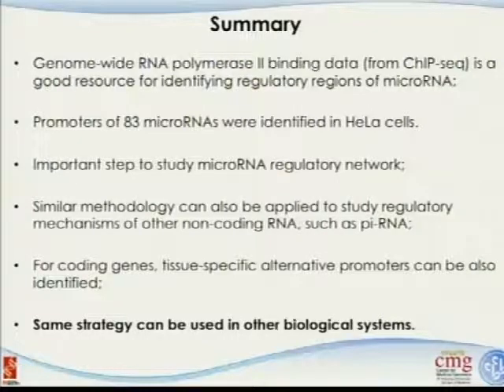Okay, and throughout this course, this is the first time I'm talking about my own research, and I always talk about others. The reason for this is, in a ChIP-seq experiment, if you go outside to talk to other people, most people just tell you the peak finders, and they assume that is ChIP-seq. That is not. That is one part of a ChIP-seq experiment, and there are many different algorithms, many different groups already studied that.